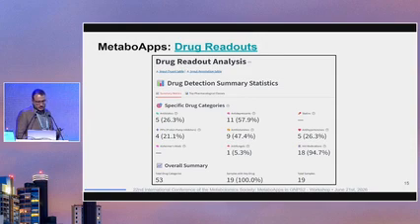And then it's going to classify the most present ones. So in this case, it's going to be antibiotics, antidepressants, statins, PPIs, antihistamines, antihypertensives, Alzheimer medications, antifungals, and HIV. But those are not the only ones. Those are just the highlights for the summary. But if you check the whole annotation table or the other inputs that I'm going to present, you can see everything that is in there.